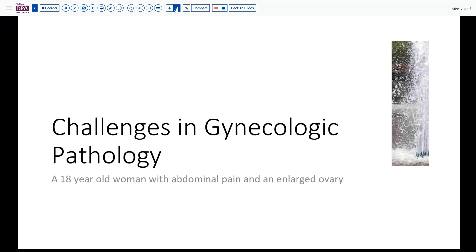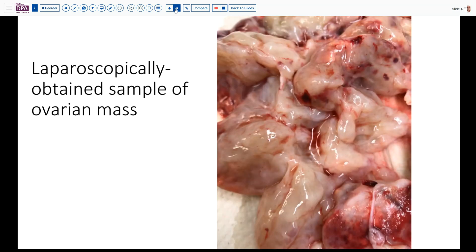Our case today is that of an 18-year-old woman who has had progressive abdominal pain and is found to have an enlarged ovary. The surgeon takes her to the operating room and laparoscopically sees this enlarged, almost 15-centimeter ovary, and manages to fragment it and get it into the laparoscope bag and send it to pathology. As we receive the tissue it looks very glistening, very shiny, a lot of fluid spaces, pale gray-yellow, and a few hemorrhagic foci.